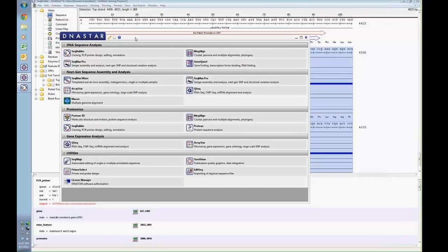To compare that sequencing reaction against the wild type, I would simply mark the one as the reference, hit assemble, and basically there's my contig that has been generated. There's my reference, there's my sample. If the reference is annotated, there's my annotated reference, and then I can expand on this little triangle in the alignment view to view my trace files.